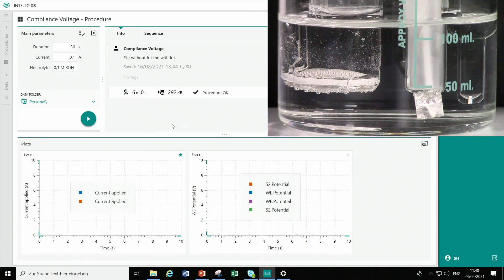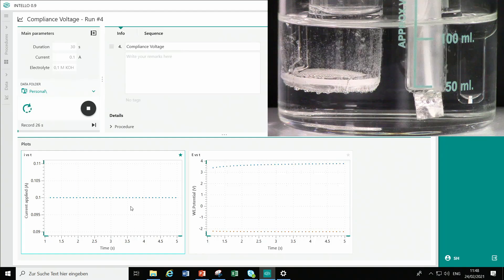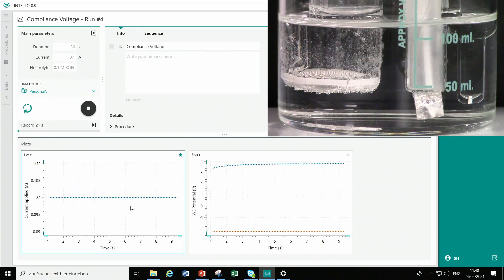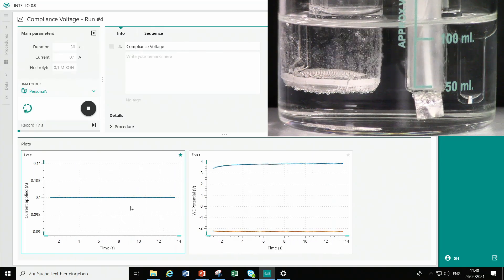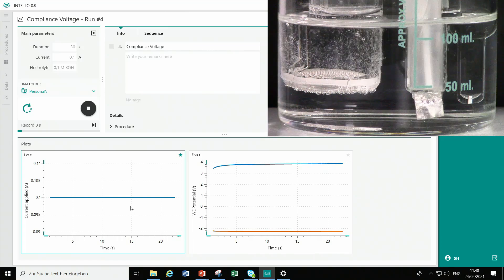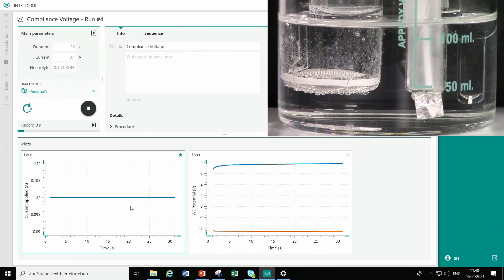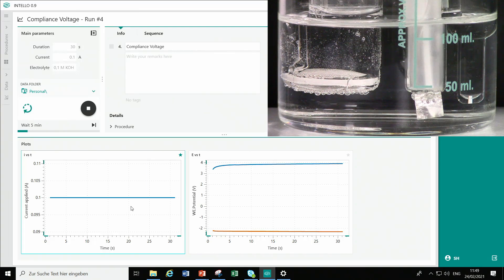Let's start the experiment without separator. A current of plus 100 mA is applied to the working electrode. The positive current leads to an oxidation at the working electrode, which generates oxygen at the platinum sheet electrode, and hydrogen is formed at the outer platinum mesh counter electrode. The potential of the working electrode with respect to the reference electrode is plotted in blue, and the orange curve shows the potential of the counter electrode with respect to the reference electrode. The potential difference between the working electrode and reference electrode is much higher than that between the counter electrode and reference electrode, because the area of the counter electrode is much larger, enabling much better mass transport.